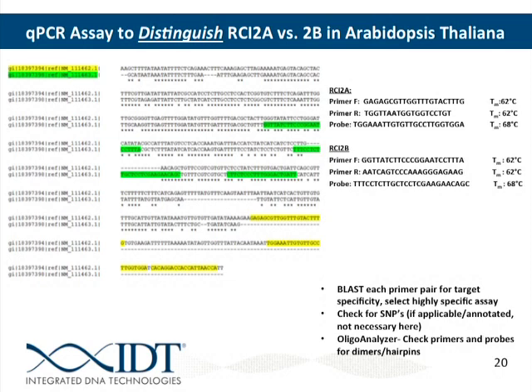So if you don't change that salt and dNTP, and just put in your oligo as is, remember the Tm was 62 when we did change that. Select Analyze. Melting temperature is 54 degrees. You can see by putting the appropriate salt concentration in there that you get a much better representation of what the melting temperature for your oligo is going to be.